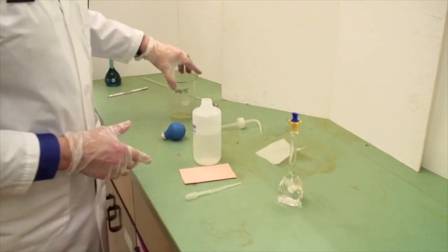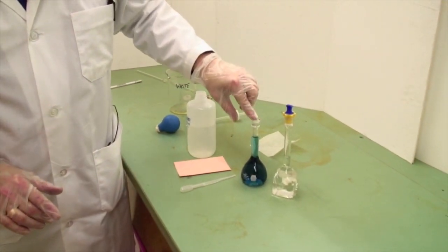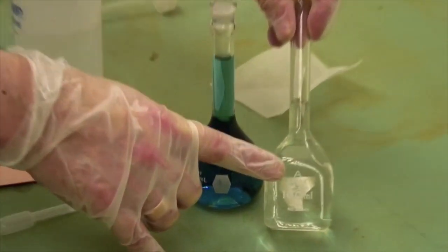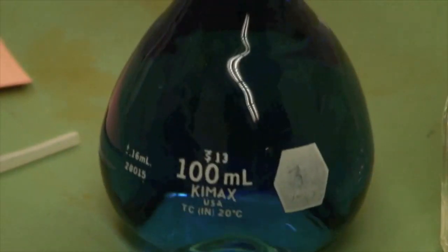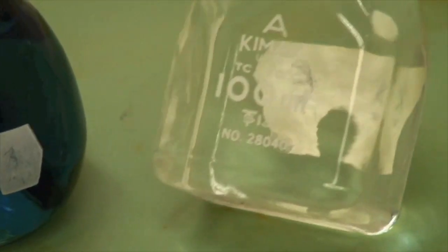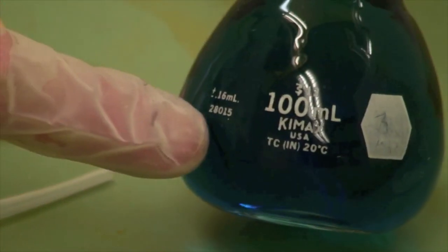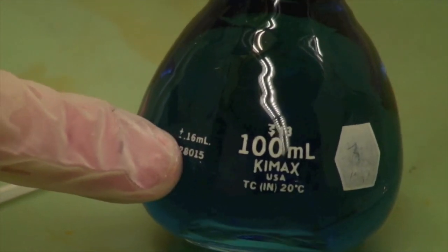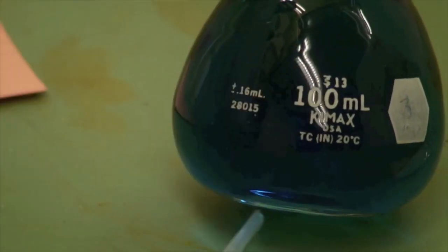Now, analytical glassware comes in two different grades. This particular volumetric flask is B grade. This is an A grade volumetric flask. And you can tell because it's got a capital A printed right on the label. This one does not. So it's B grade. An A grade volumetric flask is, in fact, plus or minus 0.08 of a mil. The tolerances for B grade is twice that of A grade. So this is, in fact, plus or minus 0.16 of a mil. This actually happens to be printed right on this volumetric flask. But there are tables in your textbook that will tell you what the tolerances are.